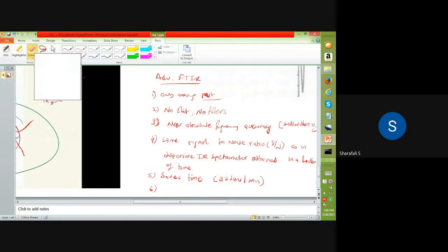That is the basic principle behind double beam spectrometry or double beam spectroscopy. That is also there in your textbook, which I didn't explain, so you just check that also. It is within one page. That is not a big deal.